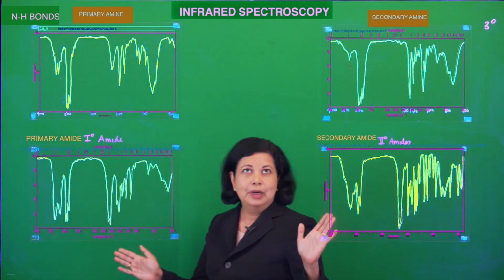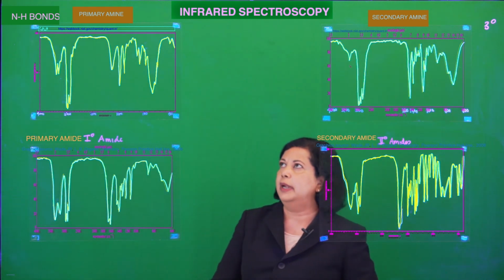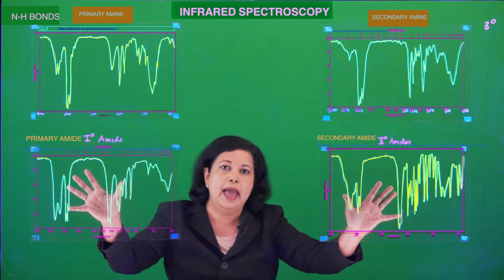Hello everybody, I just want to do one more thing with NH bonds before we finish. I want to compare the NH bonds of amines with amides.